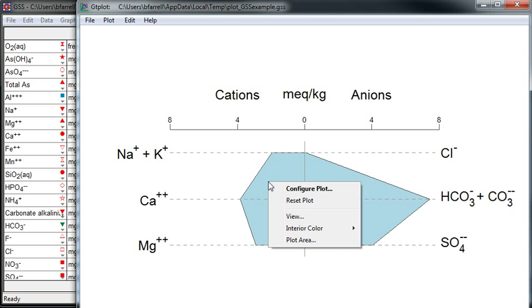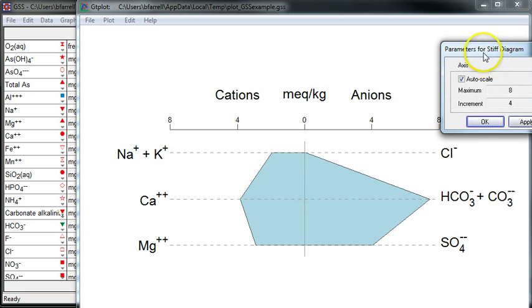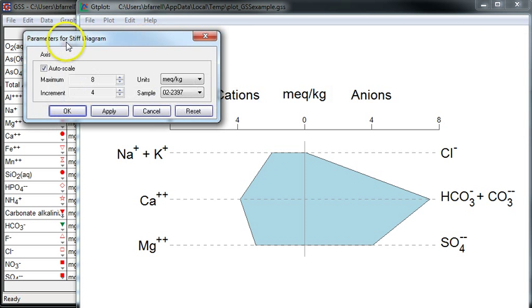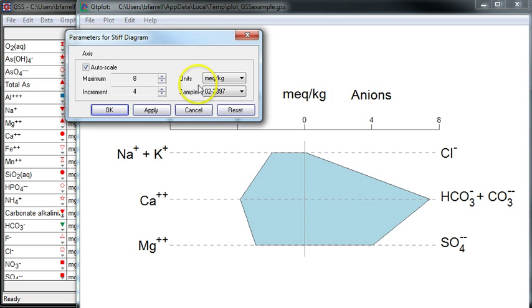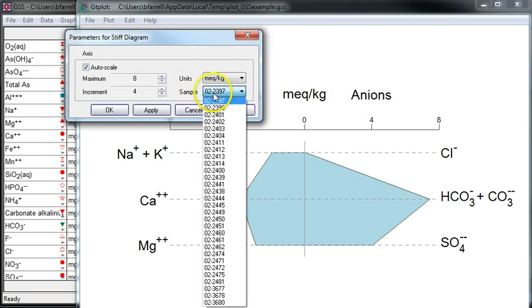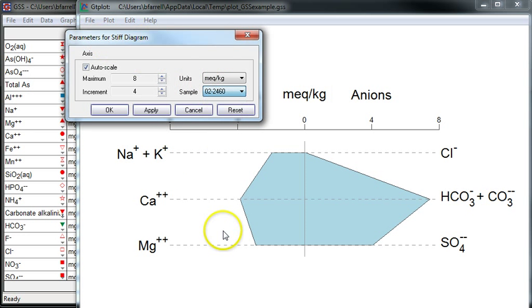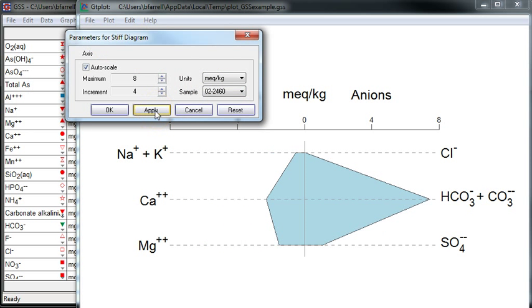I can consider different samples by right-clicking the plot and choosing configure, and now I'll select a different sample from the pull-down list. Click apply, and GTPLOT will calculate a new stiff diagram.